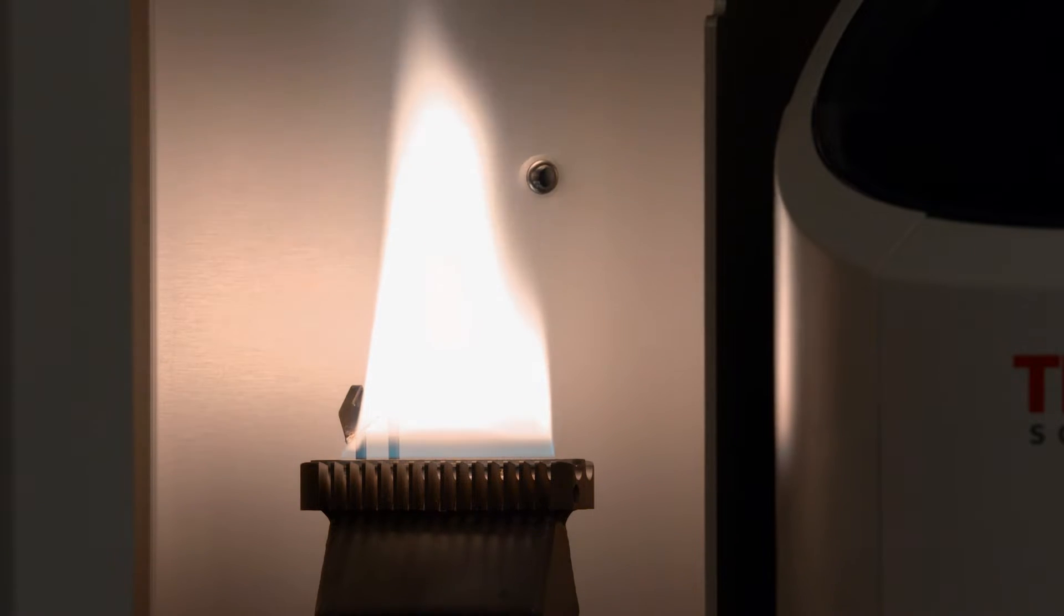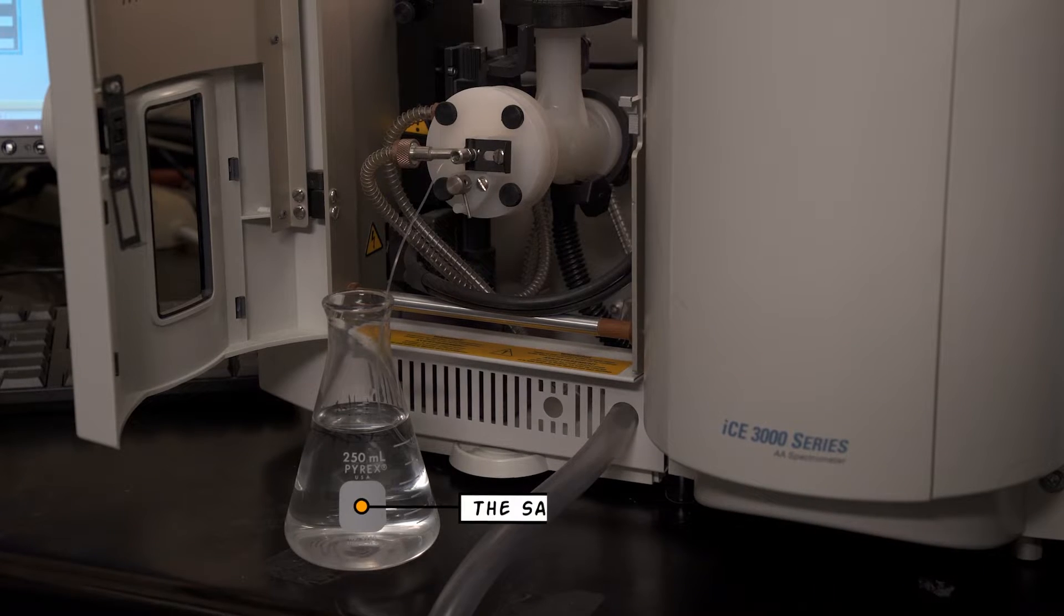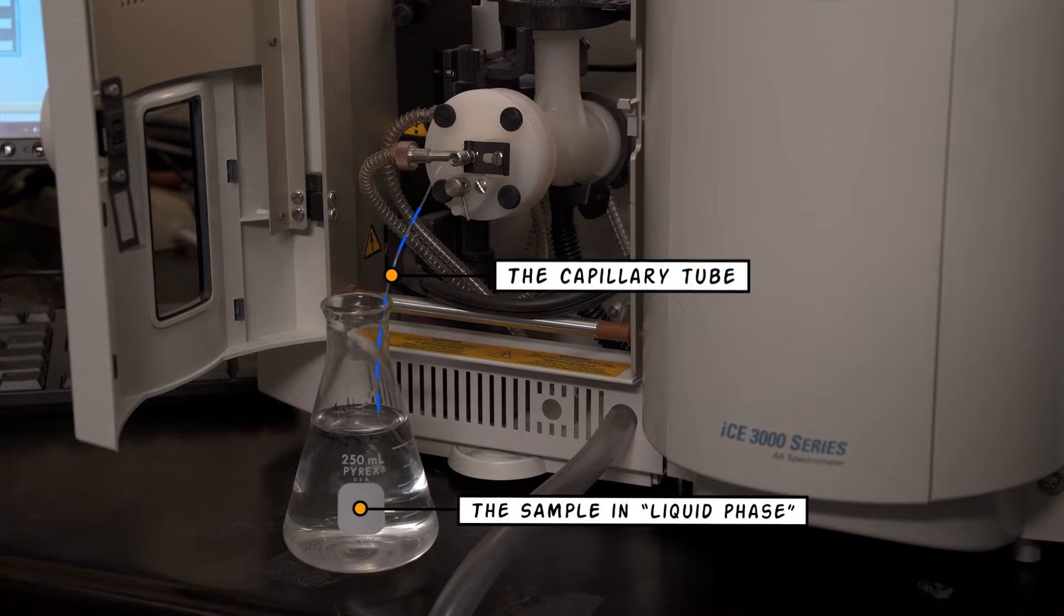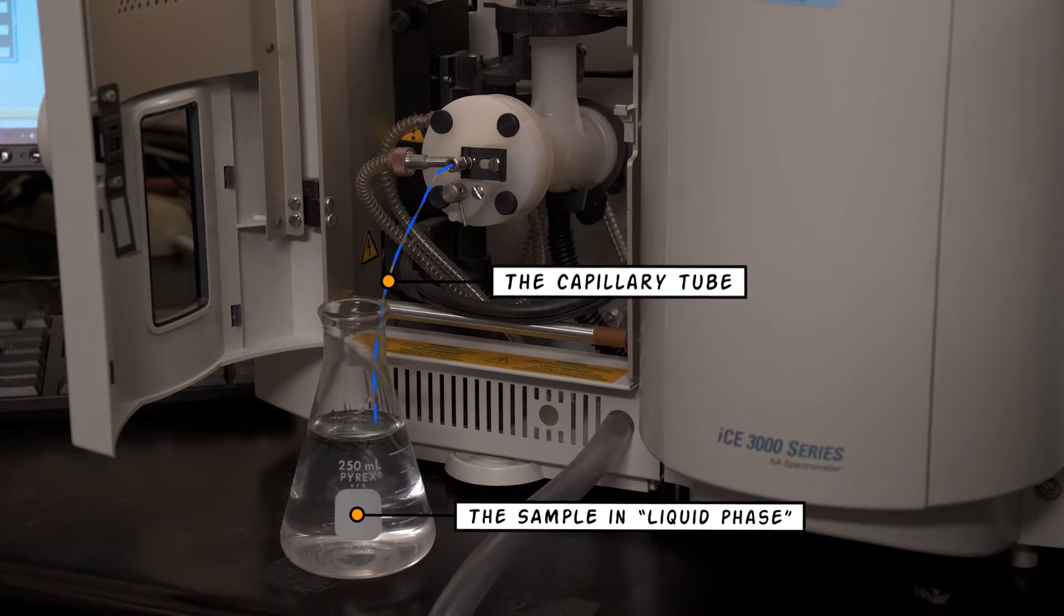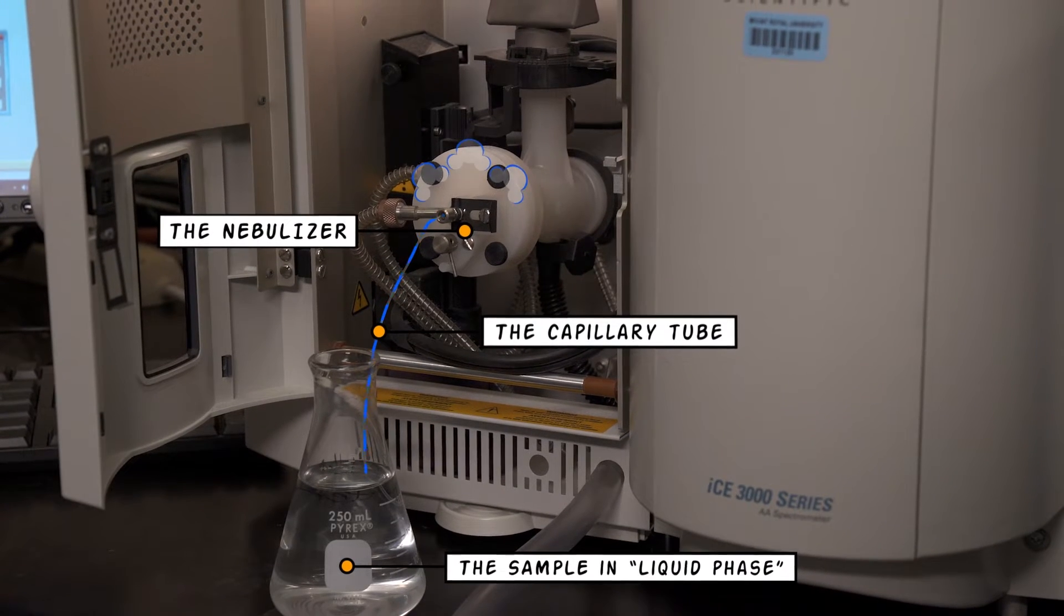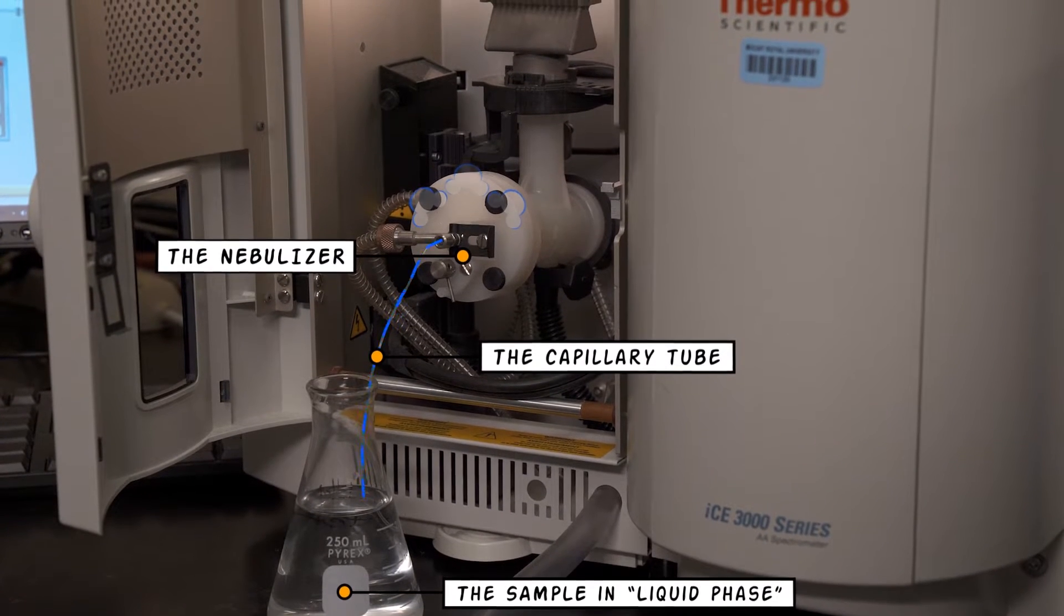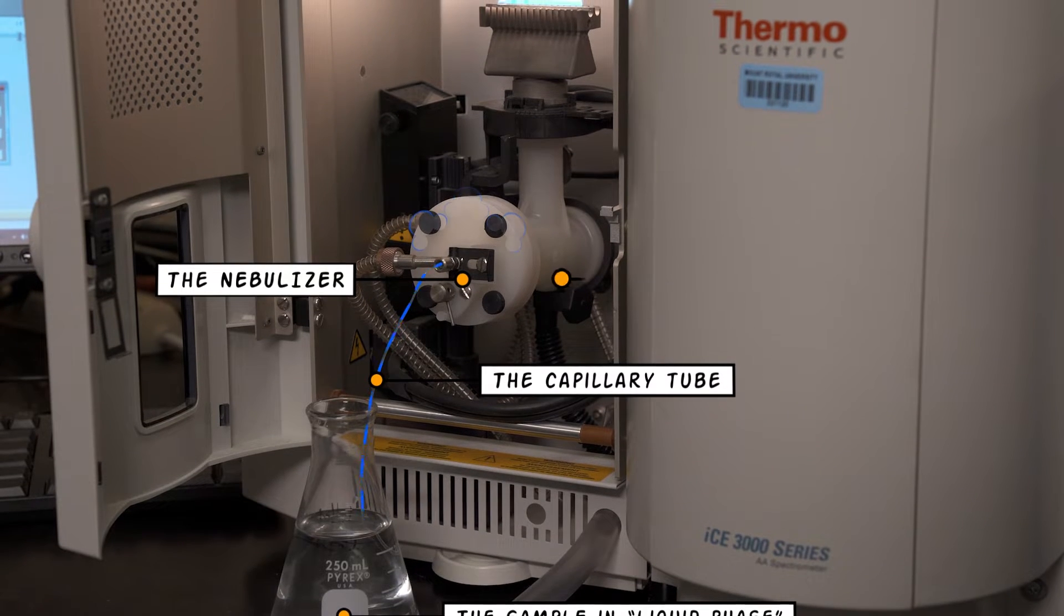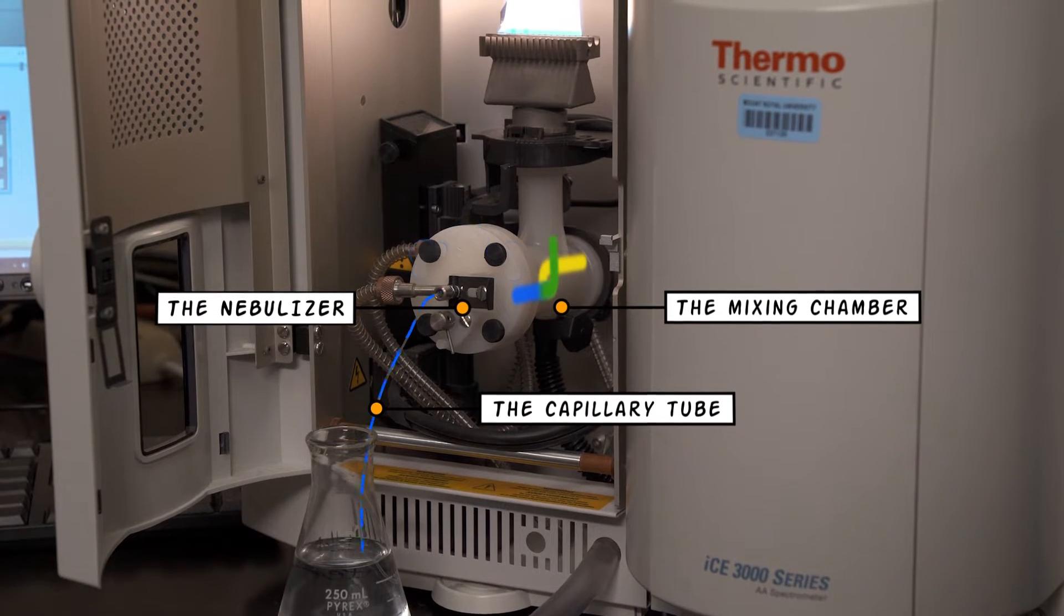The water sample containing calcium begins its journey in the liquid form. It is sucked into the machine through this capillary tube, which looks like a straw. The sample then moves through the nebulizer and it is converted into a mist, like that that comes out of a puffer for asthma.